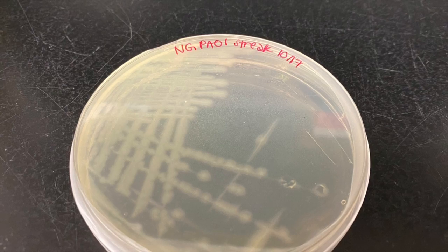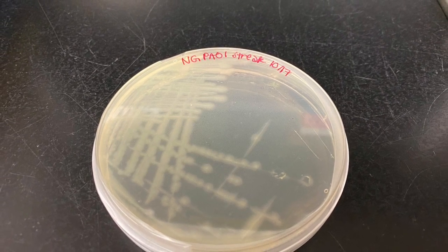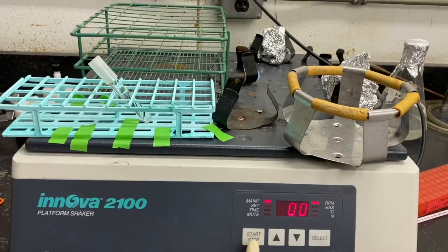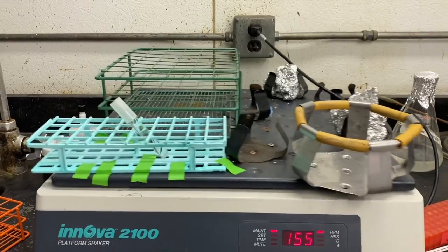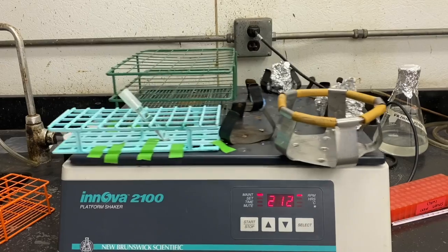Grabbing colonies from a streak plate, be sure not to puncture the agar. Lightly scrape the surface. Vortex the liquid culture to create a homogenous concentration. Then incubate your liquid culture of the target organism Pseudomonas aeruginosa in a shaker tray for 8 hours at 37 degrees celsius.